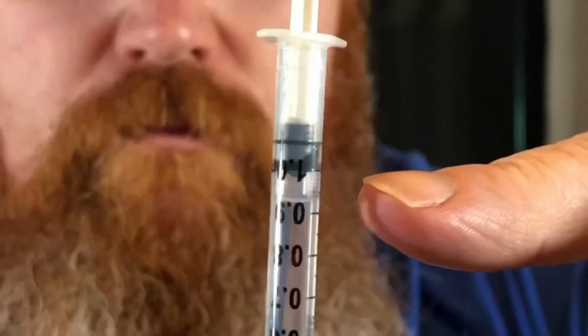Alrighty. So, not sure if you can see here, but because we've got the little nib on the end of it, which helps with the actual individual little drops, you fill it up as far as it will go, but where this black bit is in the plunger, it needs to be at the 1 mil mark. And that means, because this bit here holds about 1 mil, you've got that 1 mil left over at the top here. Not sure if that makes sense, but we always struggled with that when we first started.